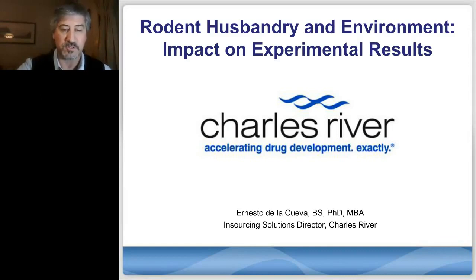I think it's an interesting topic, and the talk is going to be around rodent husbandry and the environment we keep the animals in, and the impact that this may have, and this is a very important thing, may have on experimental results.